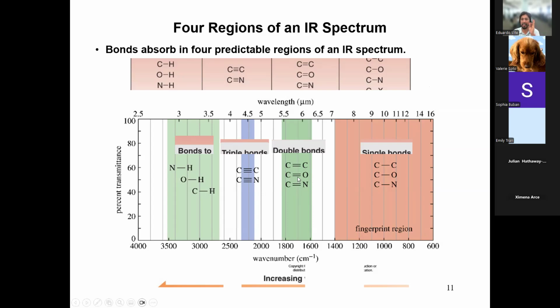These are going to be very iconic peaks, right? You cannot take organic chemistry and not tell me where the carbon double bond oxygen, we call that a carbonyl, is found. I'm sure you guys have heard the phrase, the mitochondria is the powerhouse of the cell. Well, in organic chemistry, the carbonyl is always found between 1700 and 1800, right? You need to know that for sure.